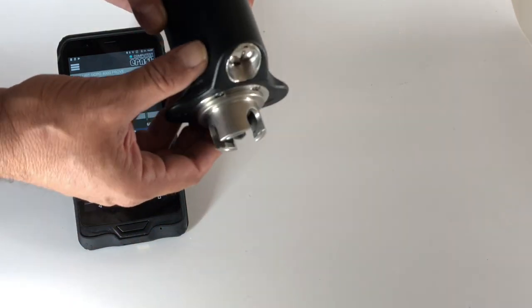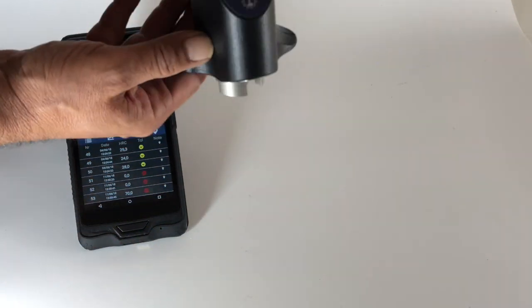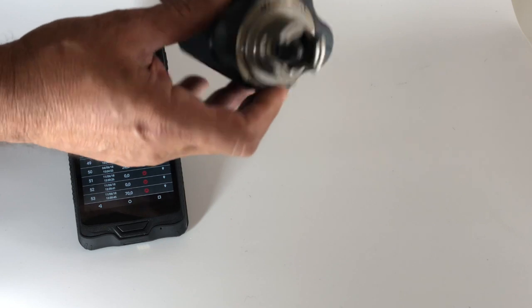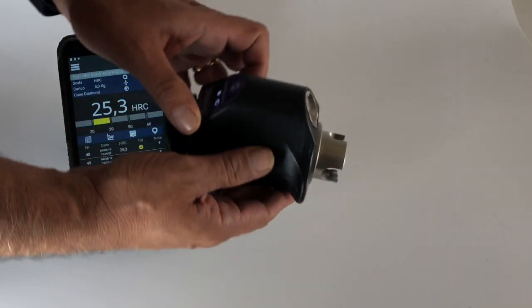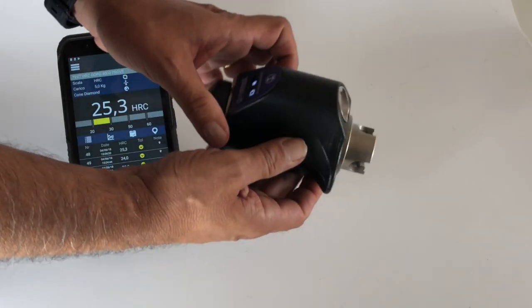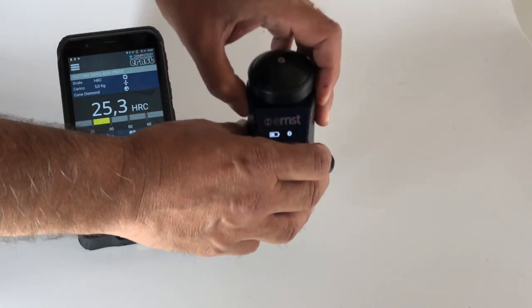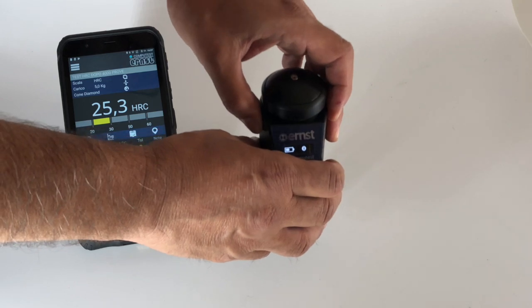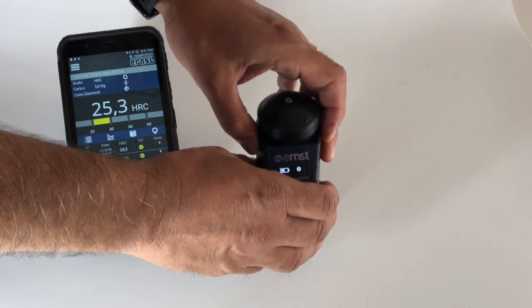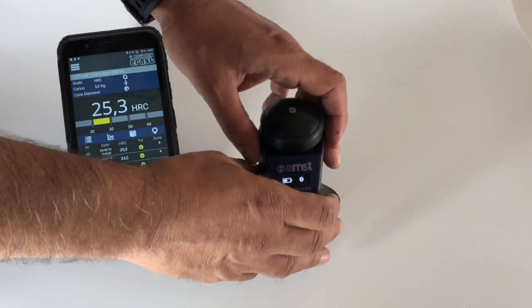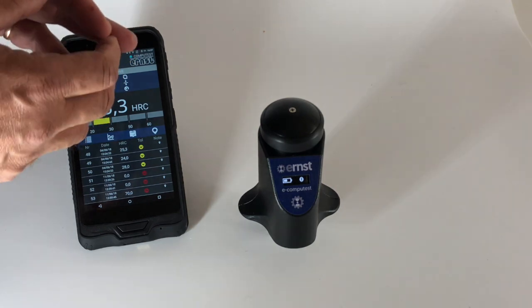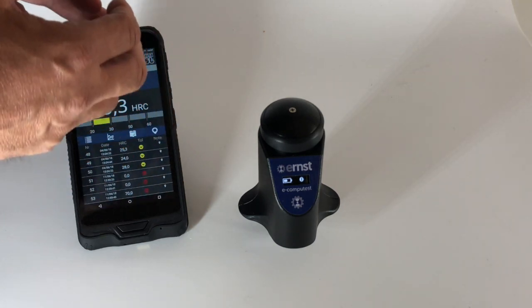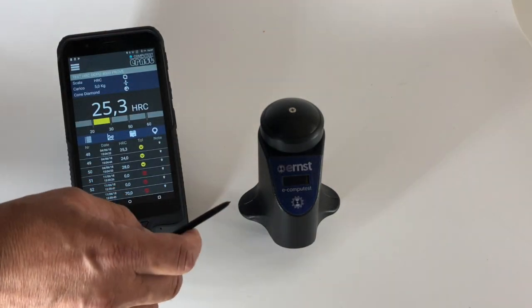You can measure upside down, you can measure in this direction, in this direction. There is no problem even if you have difficult samples, difficult to reach. Then you can measure the way you prefer and it's easier for you.